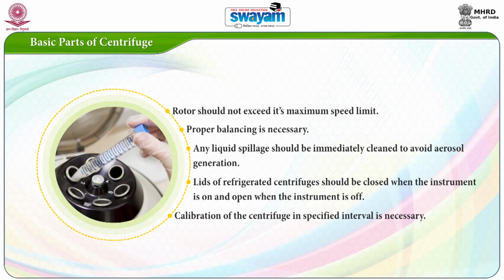And the refrigerated centrifuges are like refrigerators, right? So when the refrigeration is on, you should keep the centrifuge closed. Otherwise, what is the purpose? It is like opening the door of the refrigerator. So the lid of a refrigerated centrifuge should be closed when the instrument is on, and it should be open when the instrument is off. Why?